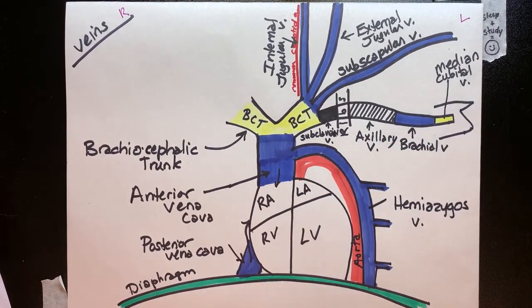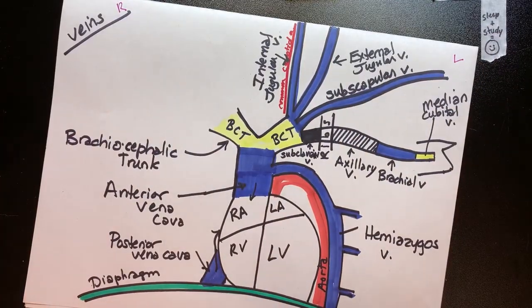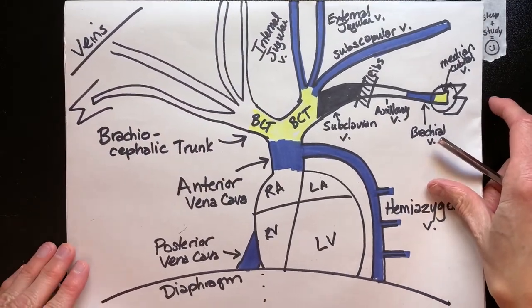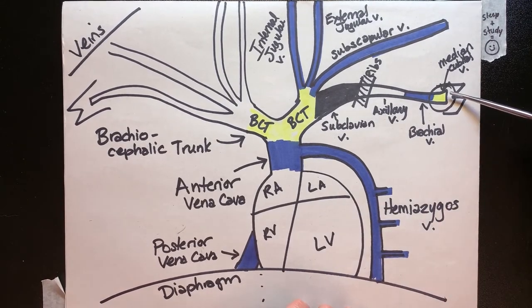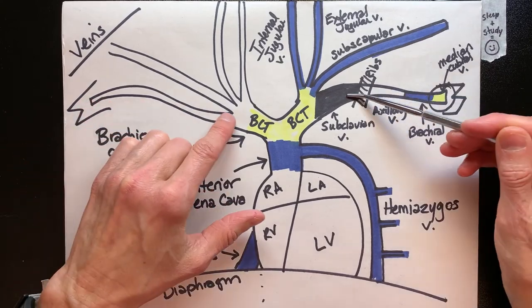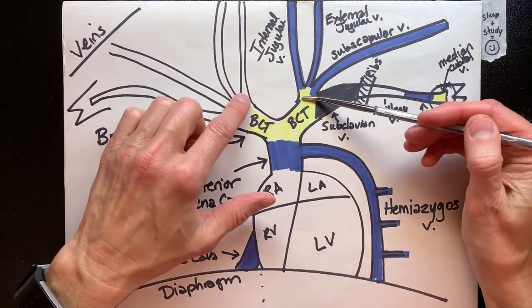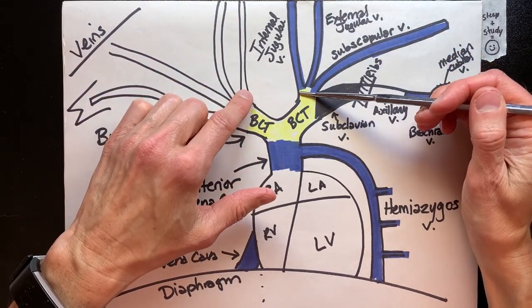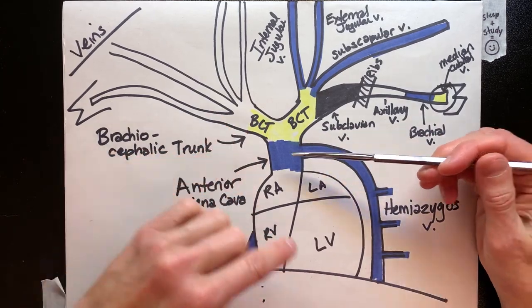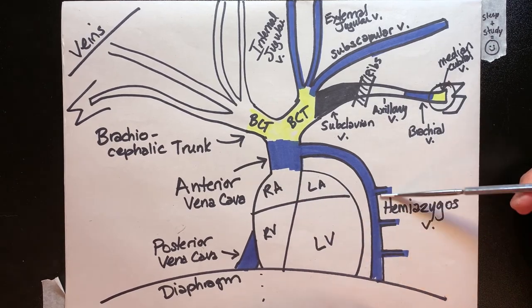That's the venous system. Looking at all the veins drawn out on both left and right sides: we can see the median cubital to orient ourselves, then coming in the same way on both sides. The subscapular, external jugular, and internal jugular veins all arrive at their respective brachiocephalic trunks — left or right — then enter into the anterior vena cava and into the right atrium. And there's our hemiazygos and our posterior vena cava.